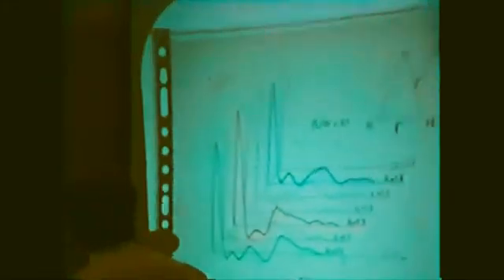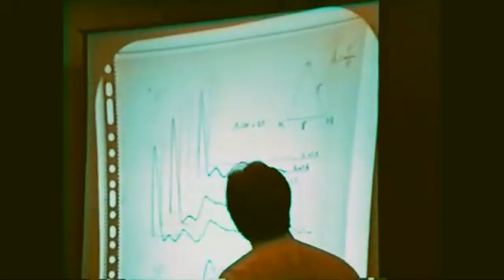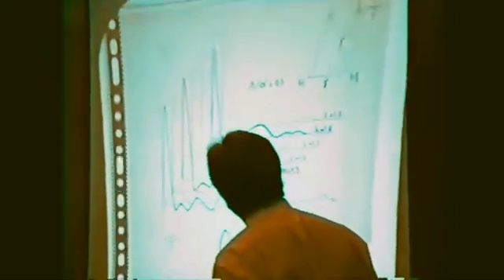This is another type of simulation which concerns triangle. We have an isosceles triangle. We keep R constant, the base, the smallest side, and we look at the variation of the signal, half part of the signal, the other part is here, when we change the ratio long side over the small one.